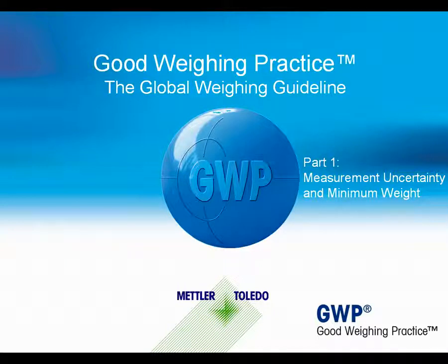In this webinar we will be talking about GWP, the Global Weighing Guideline, addressing the needs and requirements of all current quality management systems and transposing them into weighing practice. This webinar specifically focuses, after a brief overview of good weighing practice, on measurement uncertainty and minimum weight as one of the cornerstones of achieving high-quality weighing.